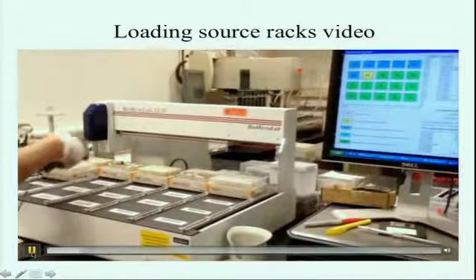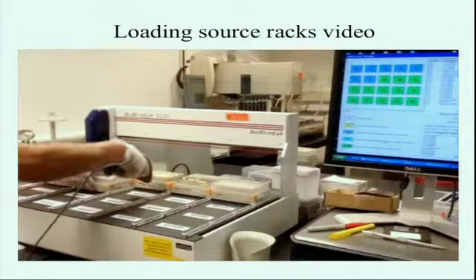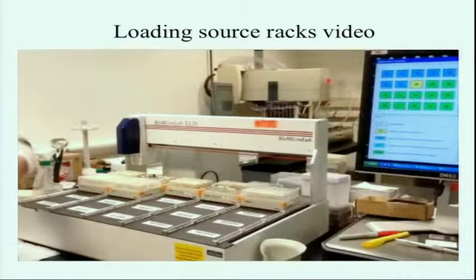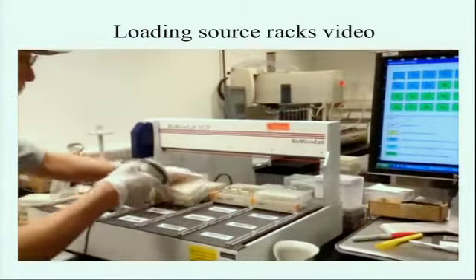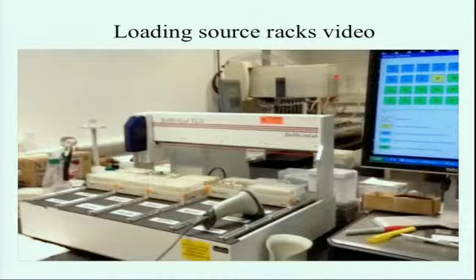There we go. So here, it's just loading using the software. You can scan in the deck position, and then scan in your source racks. And then the software will just keep track of which rack has been loaded and which one still needs to come on.